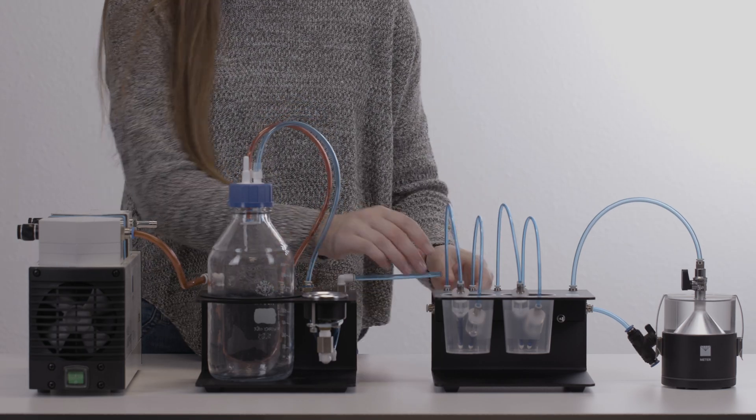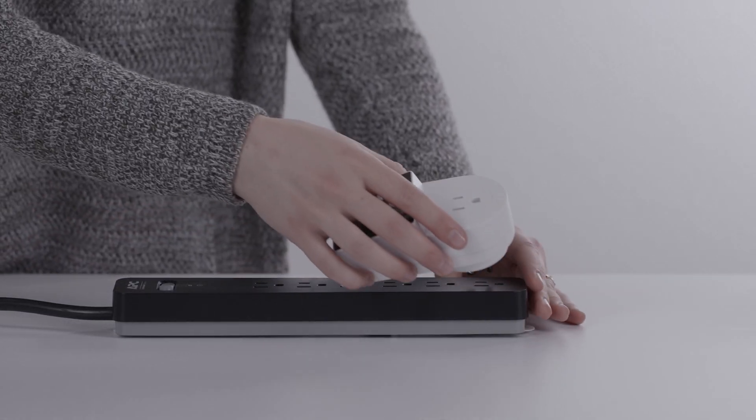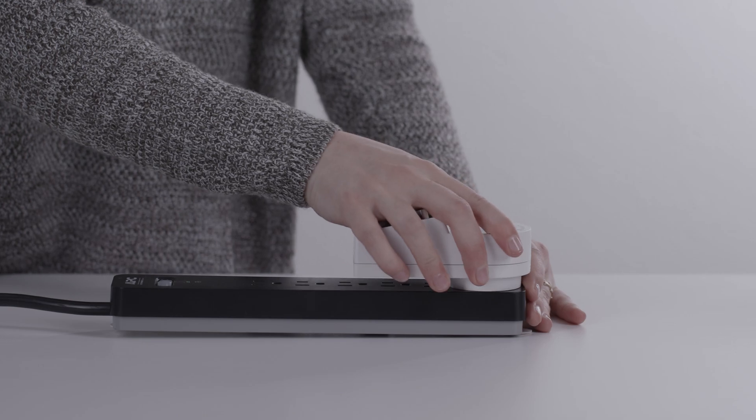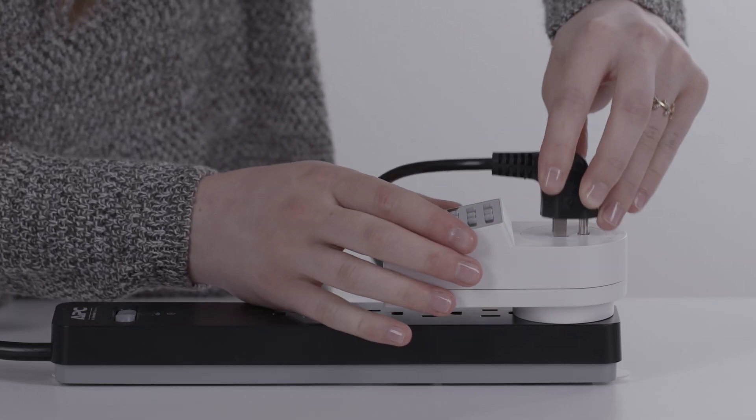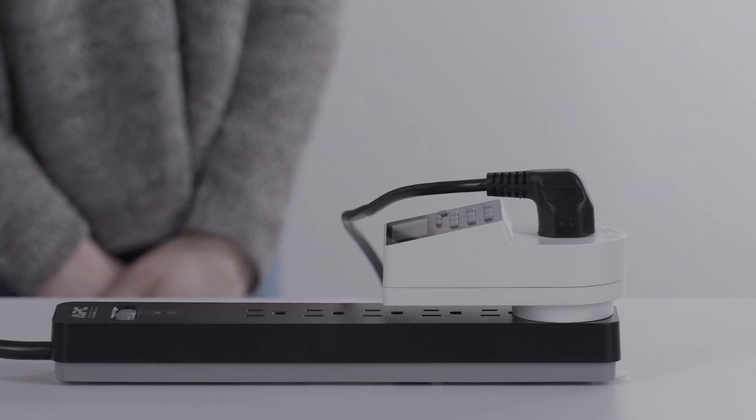Connect the tubes of the refill unit as shown. Connect the unit to a timer and the timer to the power outlet. A timer increases the pump life, saves energy, and reduces air bubbles that may be generated when the pump starts.